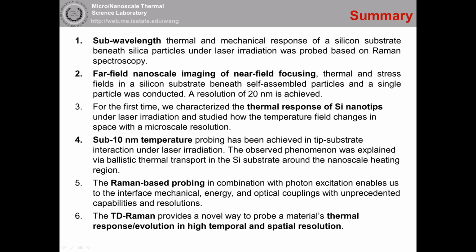Also, we can use Raman-based probing to measure the interface energy coupling, like mechanical stress and also temperature, and also the local spacing between the 2D material and the substrate, which is a very unique thing. And the final one, number 6, is the time domain control. So you can do time differential Raman, frequency controlled, and also ultrafast Raman using picosecond.